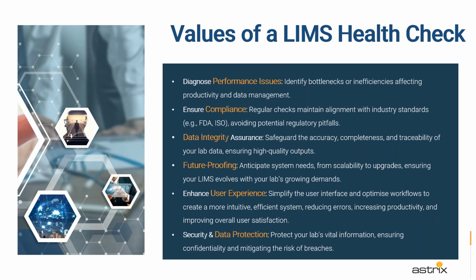In some cases, even the UI: with an older version you have a different UI. For example, for a sample registration you may have to do 5 clicks, and now it can be done by 1 click. All these things enhance the user experience, and everything can mainly be achieved while doing this periodic LIMS health check.